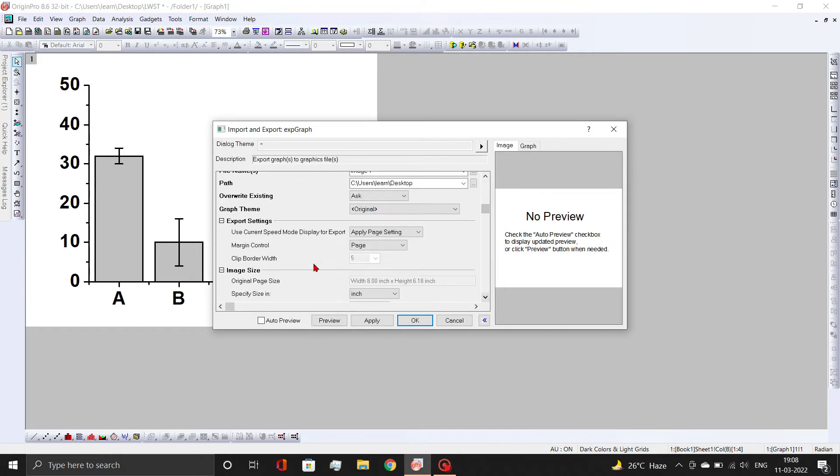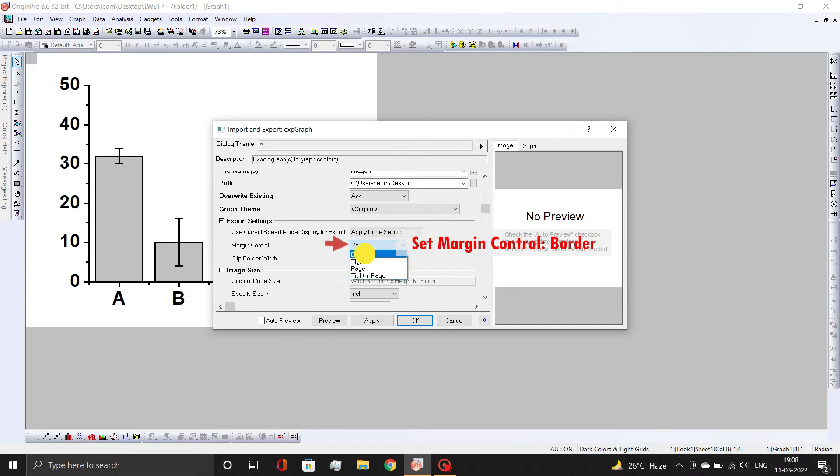In the Export settings, change Margin Control to Border and set Border Width value to 1.